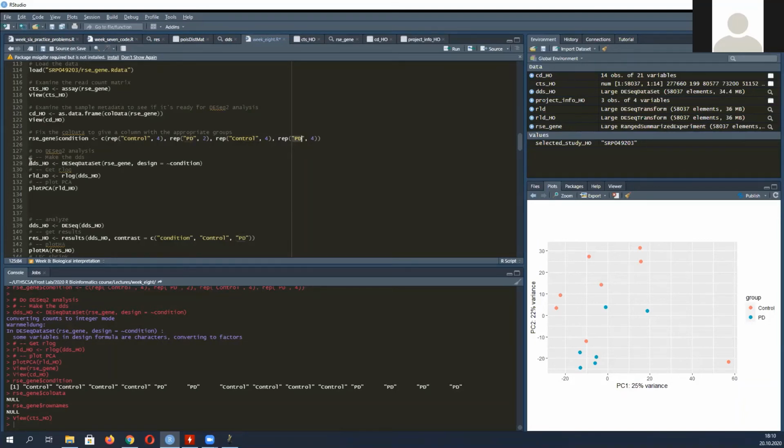And then made the DESeq object, transformed it into the PCA. And so this is what it looks like. And so I'm just like, something's off. This one right here looks like some sort of outlier sample. But yeah, I'm not quite sure. How do I check that this vector here, so when I look at the gene condition, like.